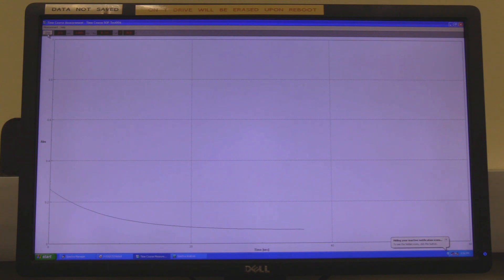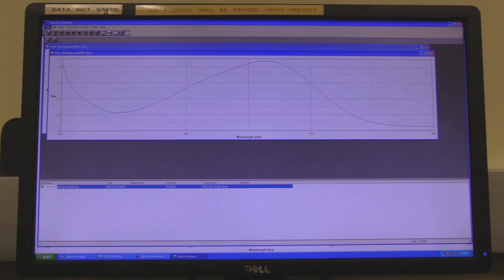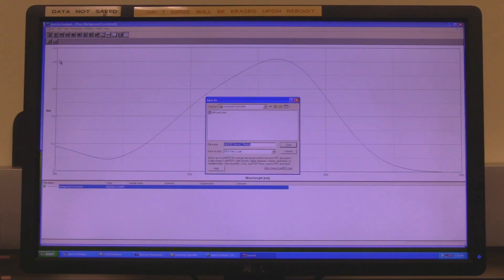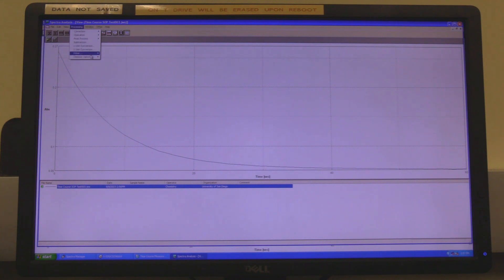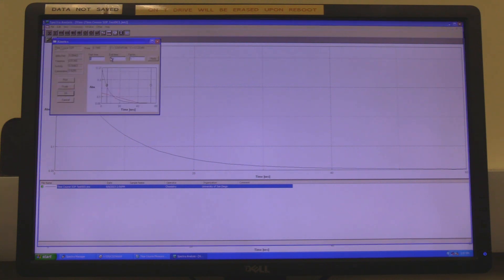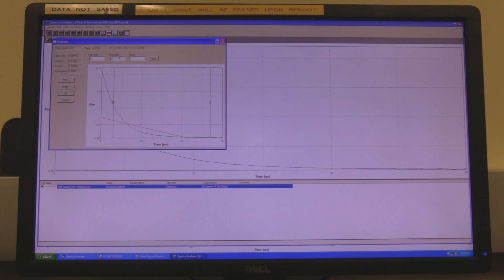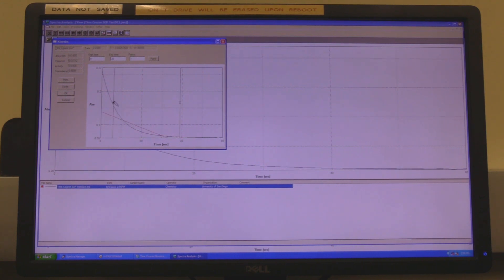When the measurement is complete, spectra analysis will automatically open. If the autosave box was not checked, in spectra analysis click on file and then on save. Find the appropriate folder, name the file and click on save. Click on processing, then on common options and then on kinetics. Input the start time and end time and then click on apply. Alternatively, click and hold on the small squares in the spectrum to drag the cursors to the desired time. Moving the cursors will automatically update the calculated data.